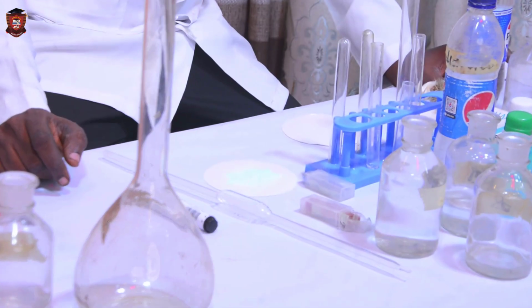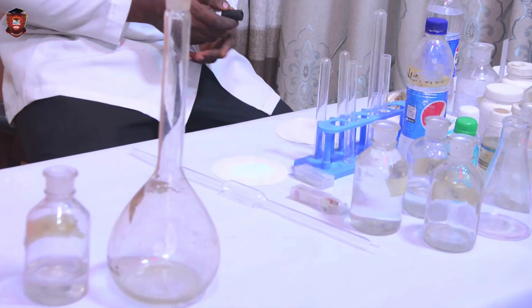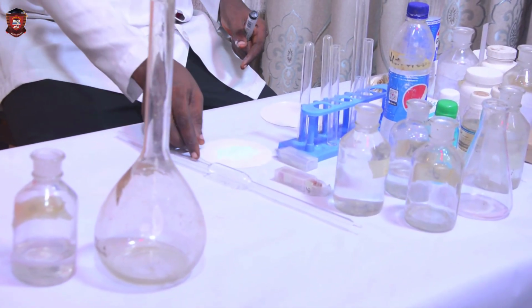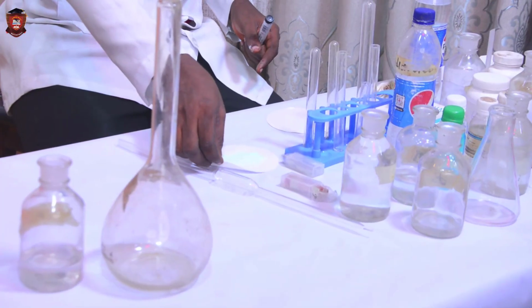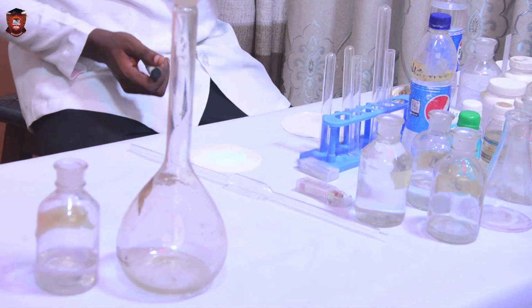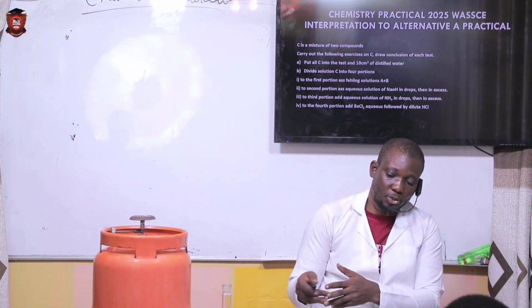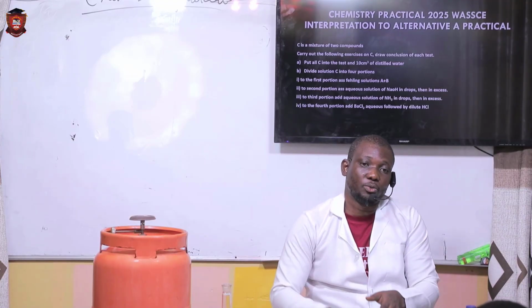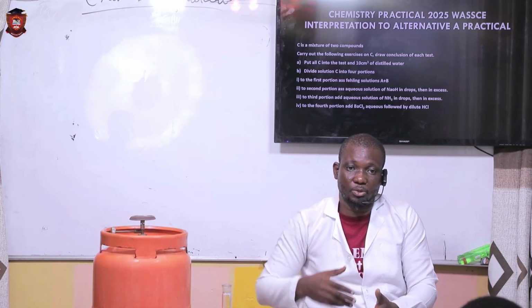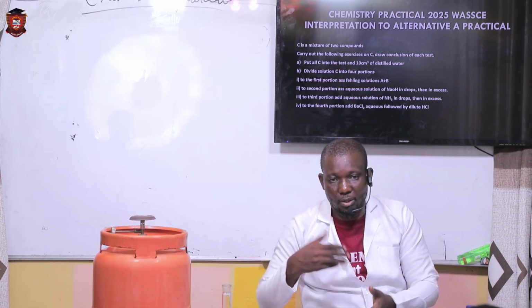In this video, we're also going to be stating the step-by-step method to identify all of these ions from these salts, and all this identification must be in aqueous states. That means we must make a solution of this before we can start to identify. And while we are making the solution, we must also observe solubility, whether the sample is soluble or not soluble.